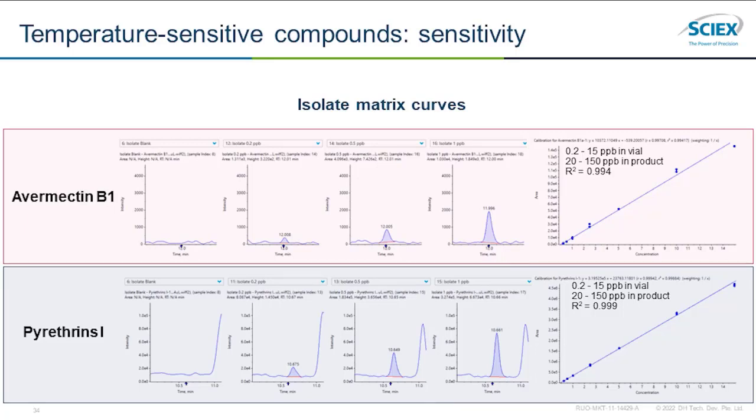And it will be important to just define what the sensitivity requirements are, since they vary so much. So in Oregon, we're meeting them easily since that's the list we're targeting. And in pyrethrins, we have the same result, with the exception that we do see this sort of peak coming off to the side. Pyrethrins are interesting because they are probably the compound you'll see the most interferences with.